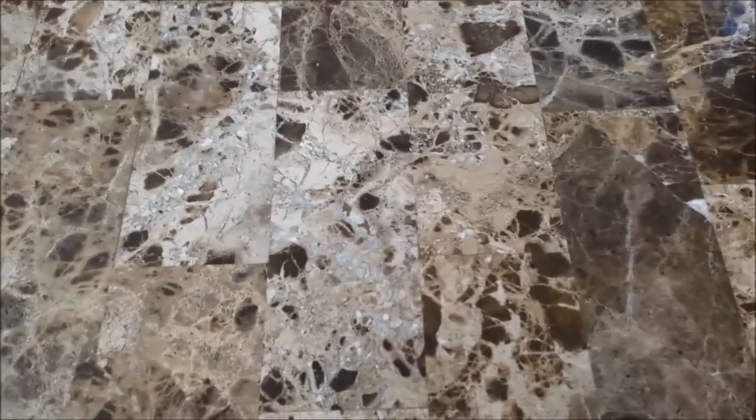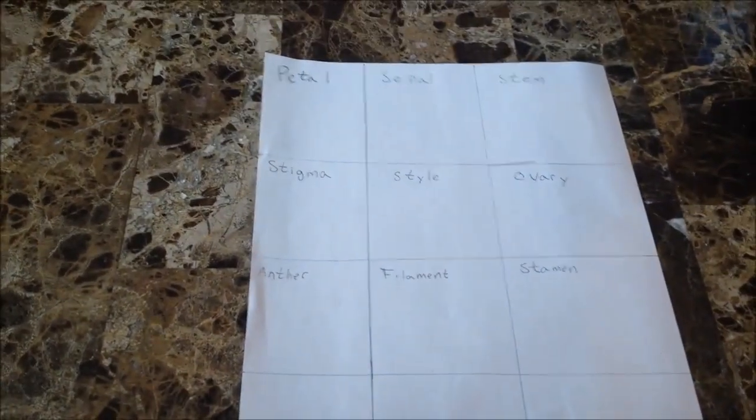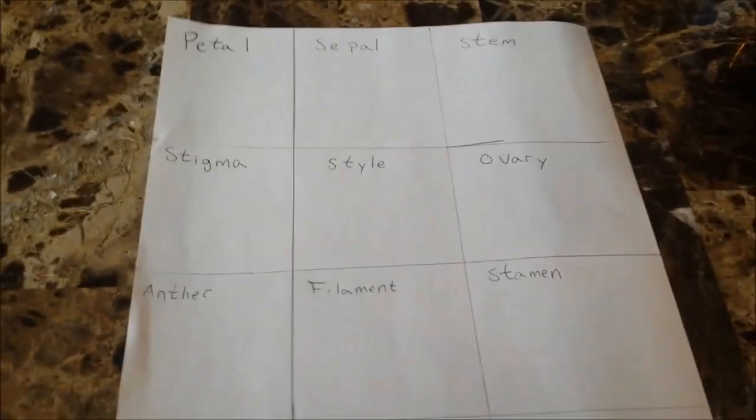Welcome to today's dissection. First and foremost, we're going to need to collect the items you'll need. Item number one being your paper with 9 labels on it: petal, sepal, stem, stigma, style, ovary, anther, filament, and stamen.